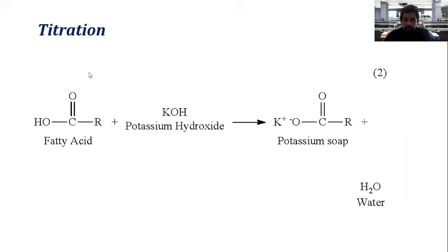So is this a strong acid, strong base titration, or strong acid, weak base titration, or strong base, weak acid titration? What kind of titration is that?